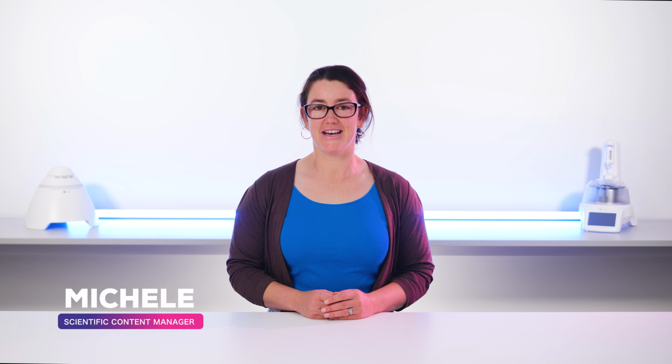I'm Michele Trott, Scientific Content Manager at Izon Science. Today, we'll be looking at the importance of quantifying the size of lipid nanoparticles, or LNPs. I'll also discuss the general approaches used when comparing and reporting particle size.